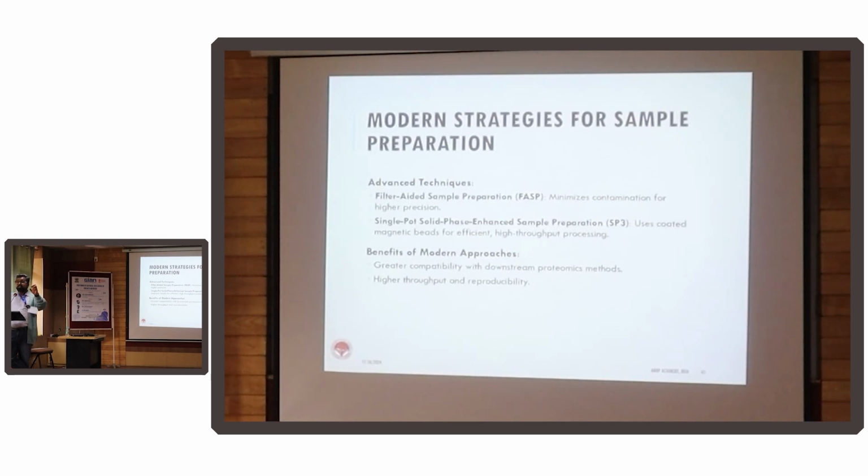Basically there are magnetic beads that are coated with SPE material, right? And then those SPE materials will preferentially bind with the peptides, and then all you need is a magnetic separator to separate out the SPE beads. Now you have very efficiently removed anything but the peptides from the sample, right?